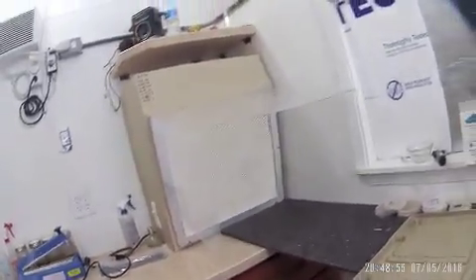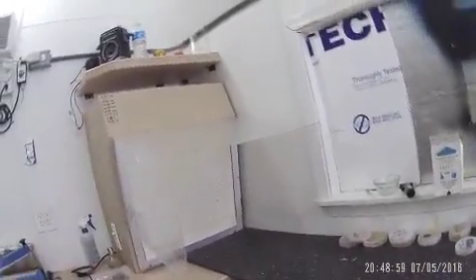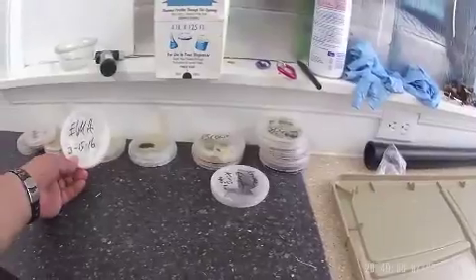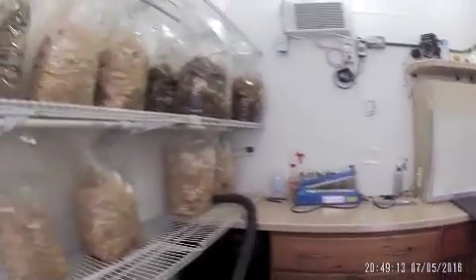And then I've got some petri dishes here that I'm working on. Some of these are quite contaminated and others are doing just fine. I need to get in here and do a lot more work and clean this out.